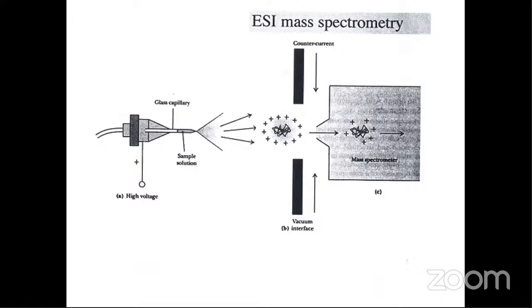Okay, so electrospray ionization, like I said, uses high voltage, and the sample with the solvent is sprayed out. The sample acquires a charge, so there are no fragments forming, unlike electron bombardment or atom bombardment. The sample itself is flowing nicely with charge. It could take plus one, 2+, 3+, and so on. Then it goes into the mass spectrometer here. So this is a very mild technique, so the fragments are not formed. So it's very good for proteins or peptides and so on, actually.